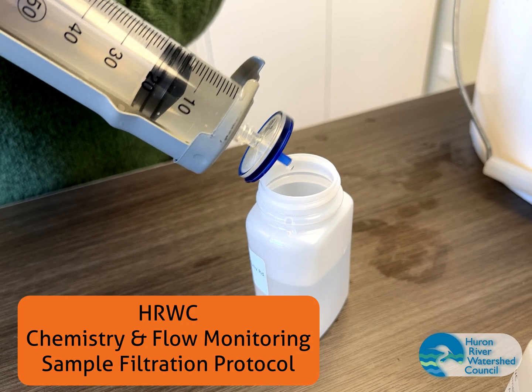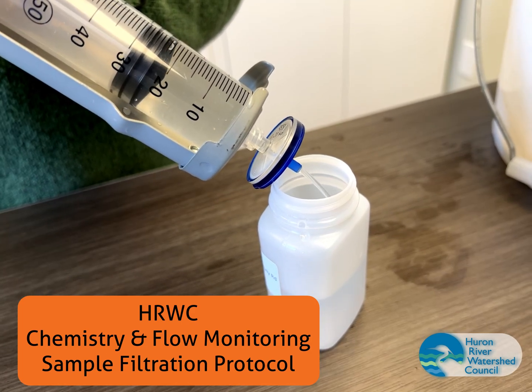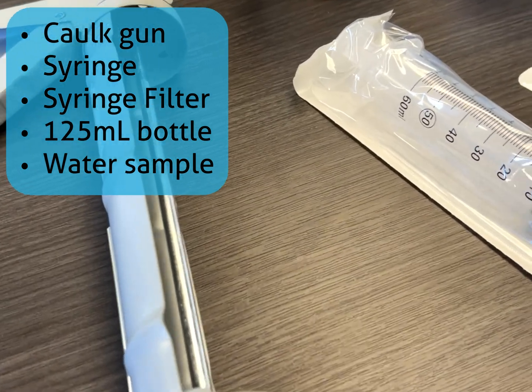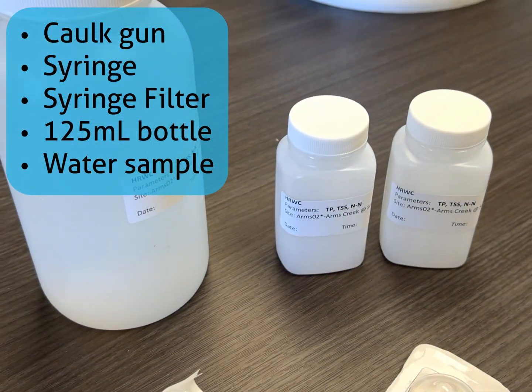You can perform this procedure while in the stream or along the side of the stream. For this procedure, you will need a caulk gun, a 50 or 60 ml syringe, a syringe filter, a bottle to collect the filtered water, and a water sample to filter.